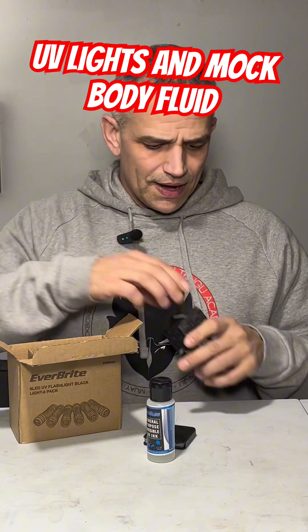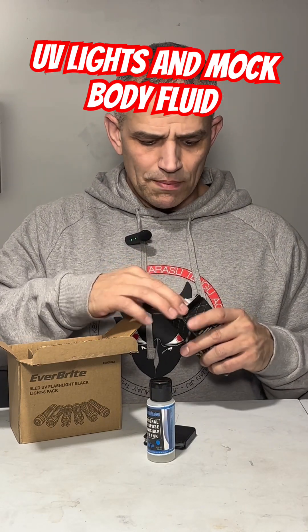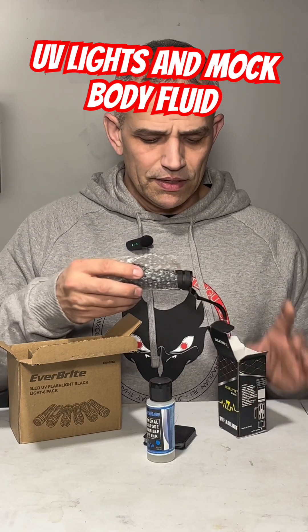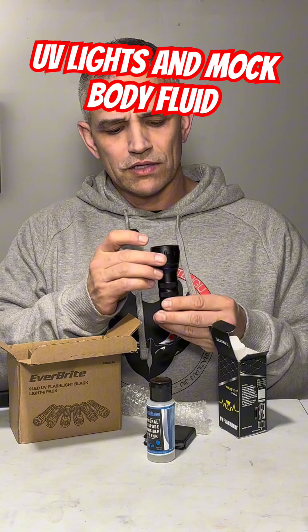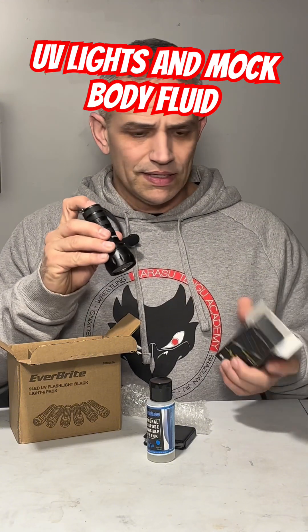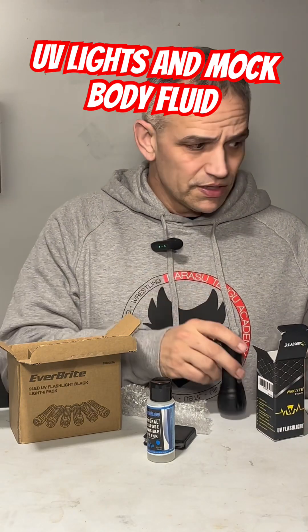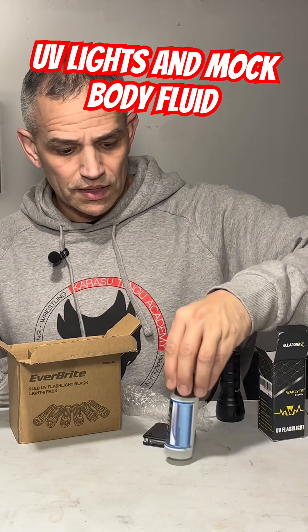I have the UV ink, and then I got this little one. It didn't come with batteries — for dramatic effect I already put the batteries in it. So I take it out of the box, but this one has more LEDs. I think it has 12 LEDs, so it's a little bit brighter. I'm going to shut the lights off and show you the difference, and then I'll show you what the UV ink looks like as well.